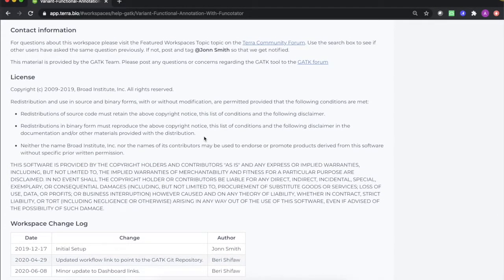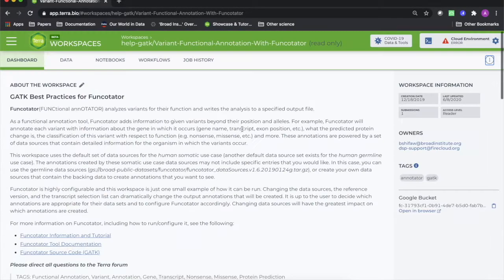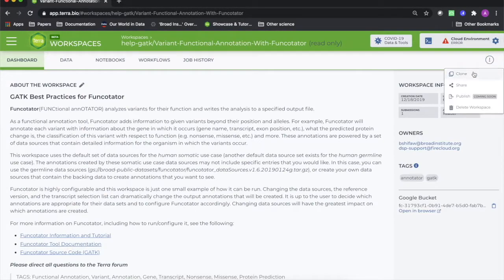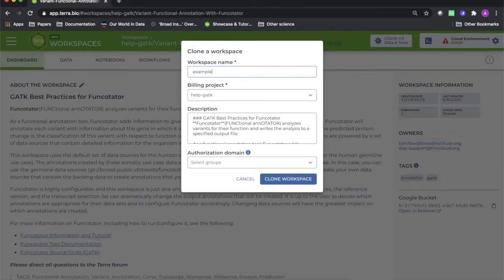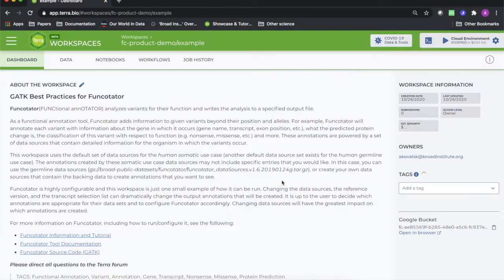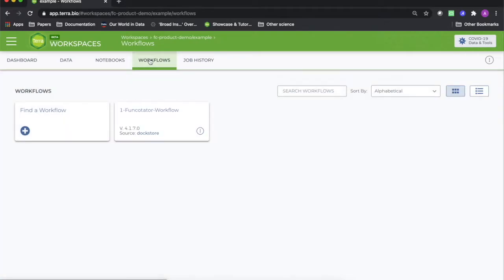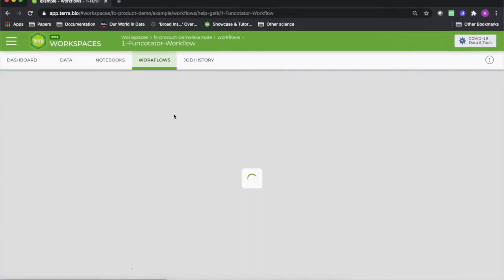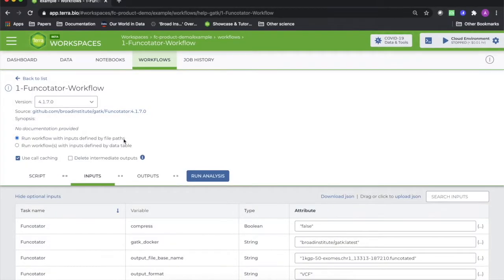You can run it as is by cloning this workspace, uploading a Variant VCF you wish to annotate, and using the provided workflow with your VCF as the input.